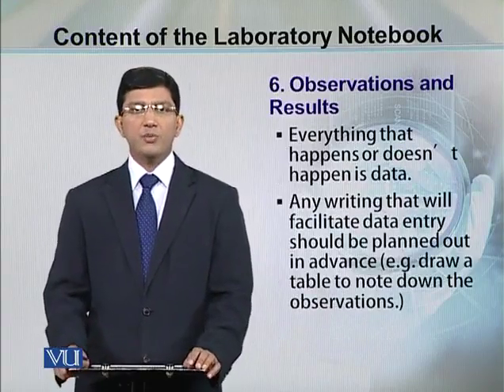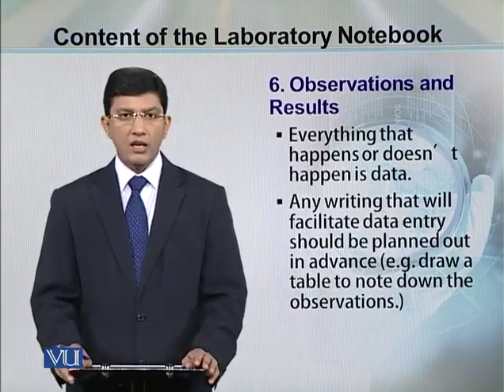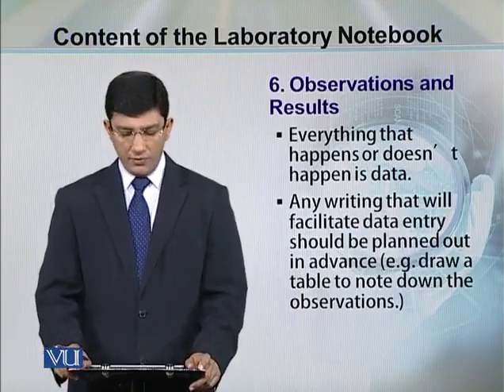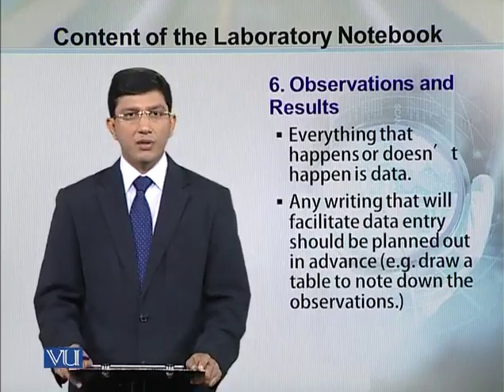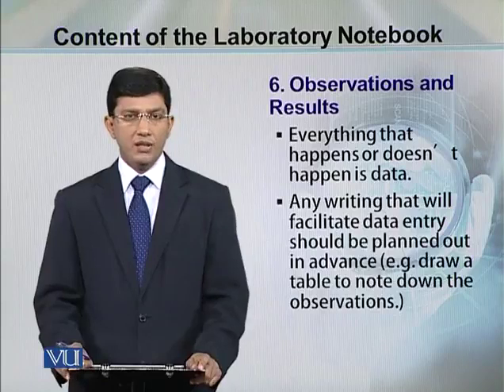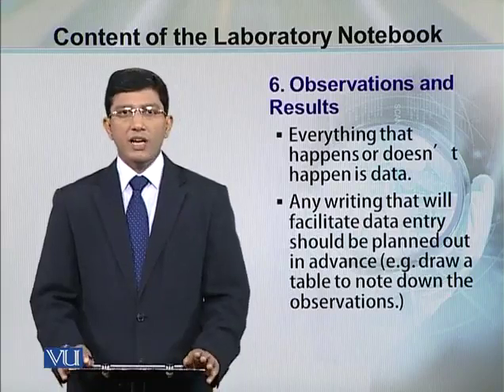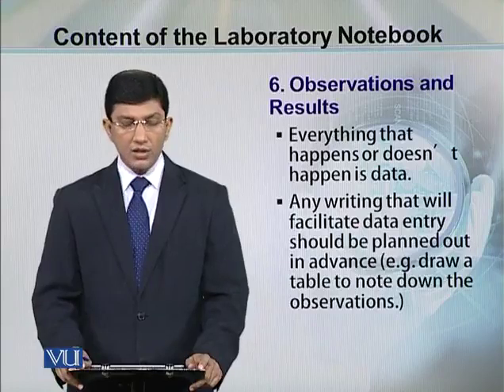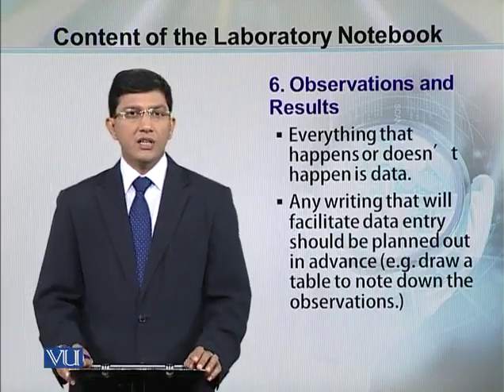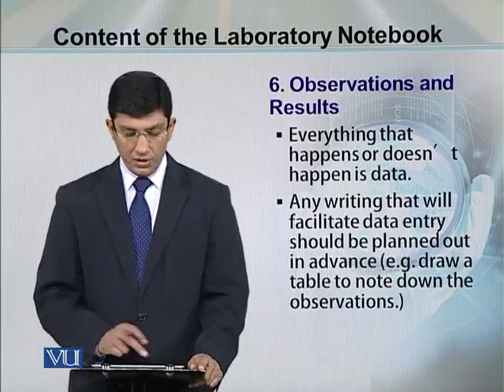Once you complete your experiment, you need to record the observations and results. Everything that happens or that doesn't happen is data. Don't expect that the results are as per your thinking. Whatever the result, it should be recorded in the notebook, and this is going to facilitate future planning of your experiments.